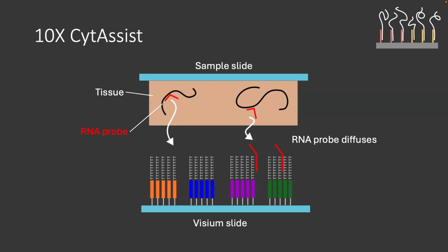They're uniform, which might give you better diffusion and blotting characteristics than if you would rely on moving the RNA. Also, you can put multiple probes on the RNA. I'm not sure they do that, but you could, so that you have a higher chance of capturing that molecule.